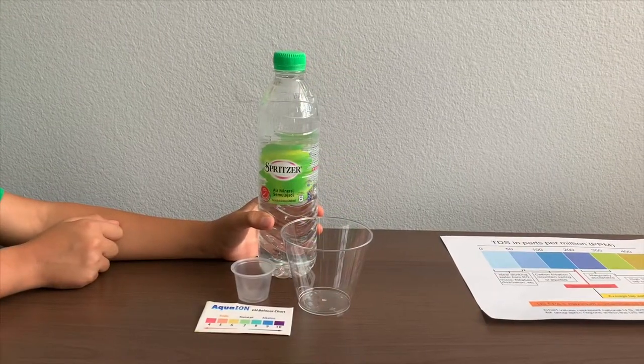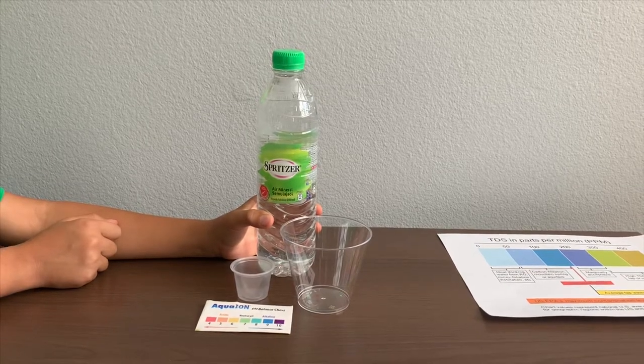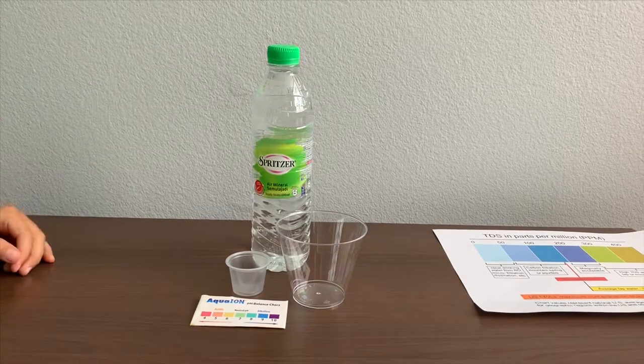This is Spritzer Natural Mineral Water. It is sourced from underground water and is a product of Malaysia. Let's test the pH and TDS levels.